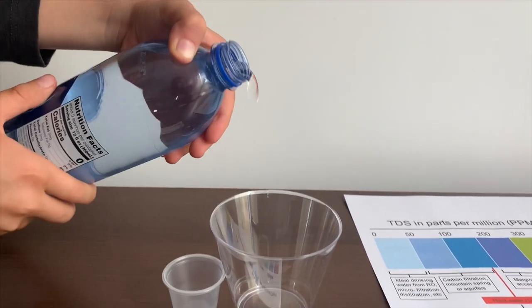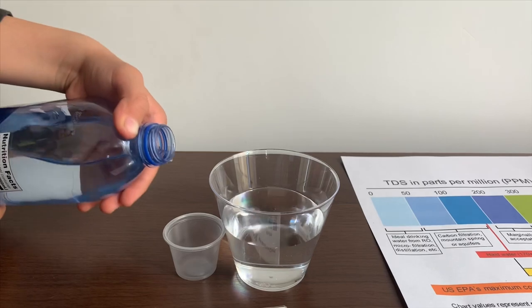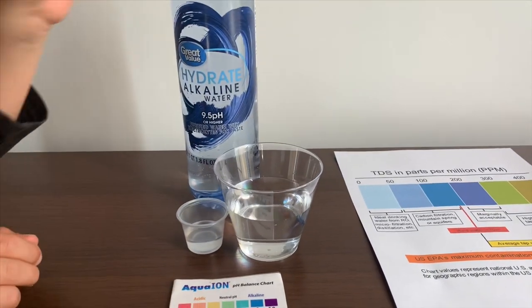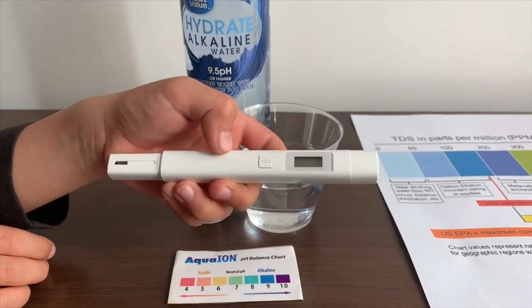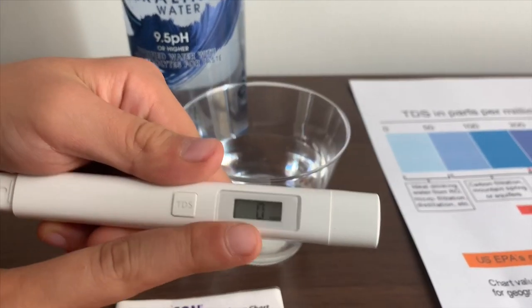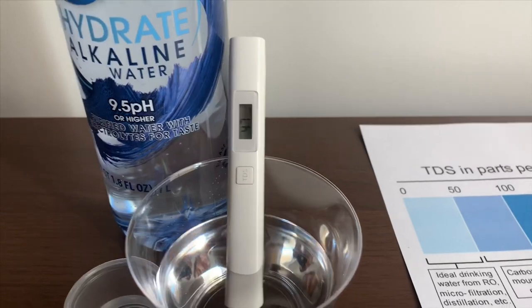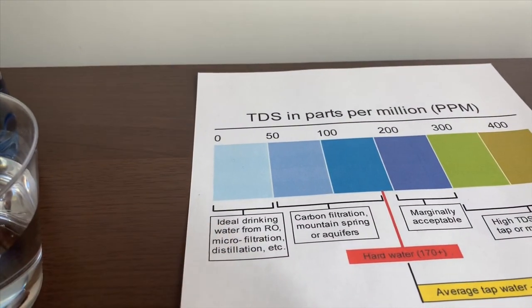Let's pour some water in. First we're going to test the TDS level. If you want to buy this TDS tester, check the link down below. Turn on the TDS tester, make sure it says 0 and put it in. 47 — that is ideal drinking water.